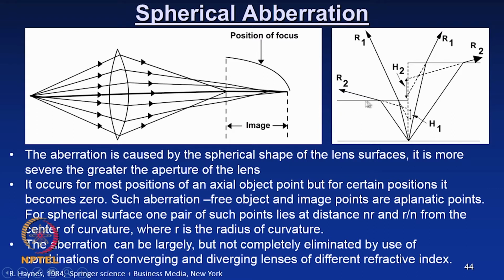normally the cover slip on the specimen is kept at a specific thickness, about 0.17 mm, and if you do not have this designed 0.17 mm thickness of a cover slip, or if you have an arbitrary thickness of the cover slip, then what happens to this spherical aberration?